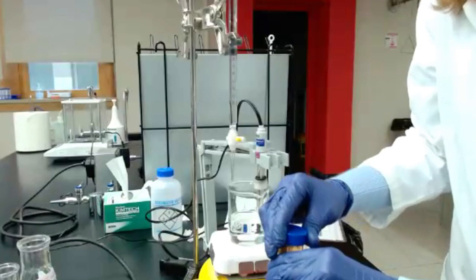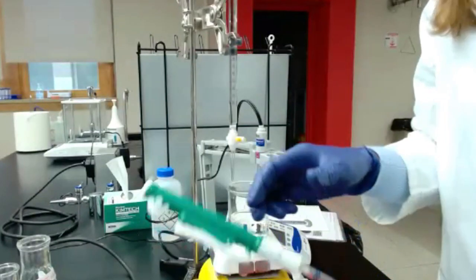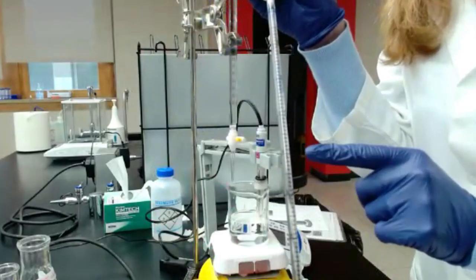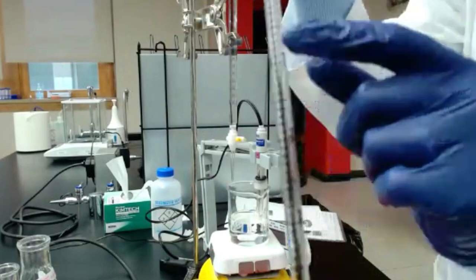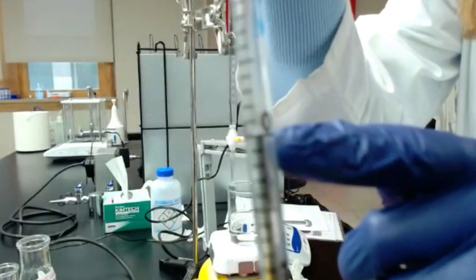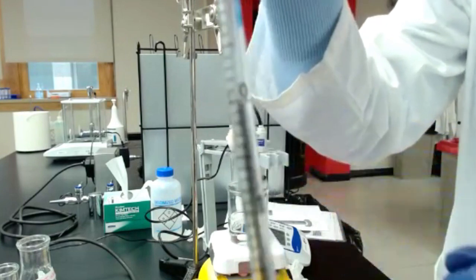You're going to use the pipette that you put with the pipette pump. The goal is to get 5 milliliters of juice. That means in this pipette, you will have to get to 0, which sounds weird, but that's how it's measured. So 5 milliliters.